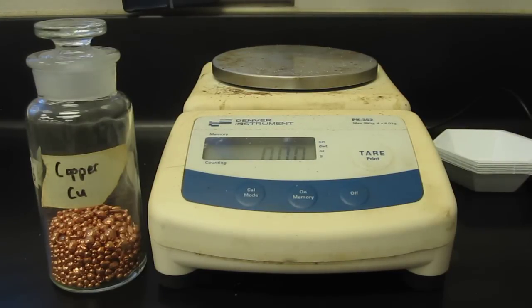Okay, let's do another video on exact and inexact numbers. This time we'll do a video on taking mass and determining exact and inexact numbers when you're doing something like this.